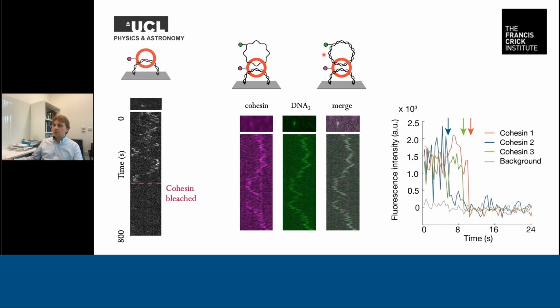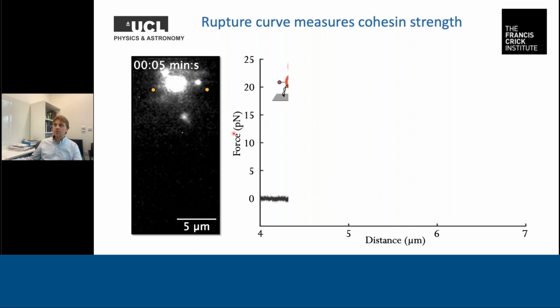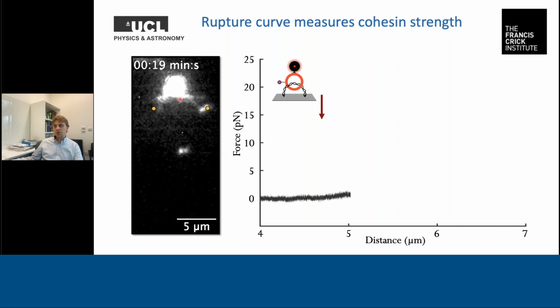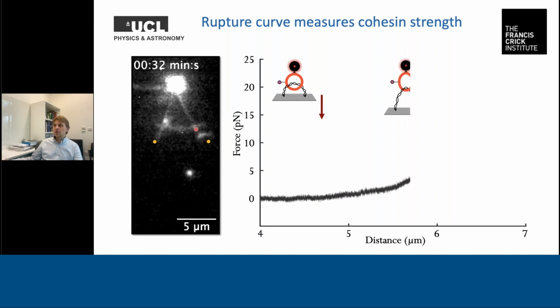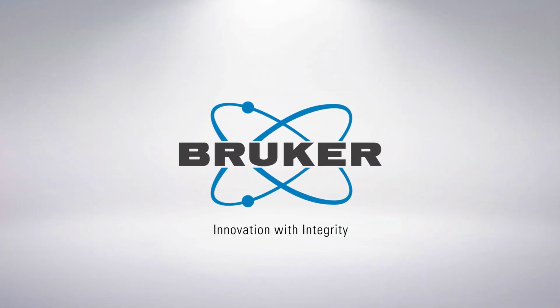We can also measure the fluorescence, which you see here: in all these experiments, all cohesins bleach in one step, and this step is exactly the same, which tells us this is really the single fluorophore that we see, verifying that we visualize a single cohesin molecule. And then the experiment itself is done something like this. You can see here on the left the movie. The bead, in this case, is slightly fluorescent just for the purpose of visualization. We pull on this bead, the DNA is being stretched, and there's a cohesin holding on to this bead, as you can see on this diagram.